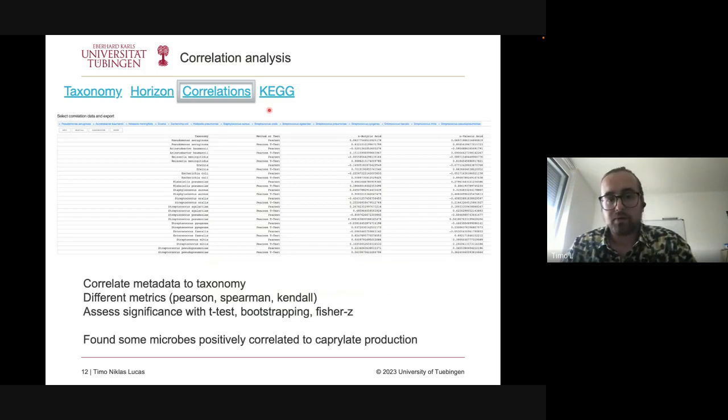Okay, what is this tool also capable of? We can plot correlations. Some people might be interested in, say, how is my species X involved in this butyric acid production? Then you would get different correlation values, either strong correlation, positive or negative, to see if there is some bacteria correlated positively or negatively to any of my production values or other experimental conditions that we can measure.